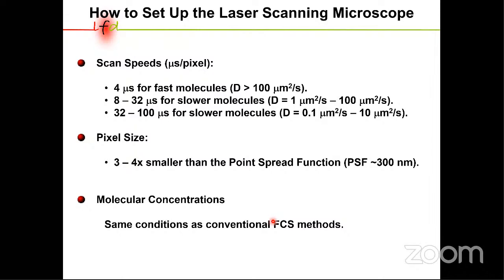It turns out that theoretically, if you increase the number of molecules, because the signal increases as well, you would expect the same signal to noise, so nothing should change. However, in the real world, you have other fluctuations. For example, from your laser, the power can fluctuate a little bit. You can have fluctuations from the electronics in your detector. And as you go to higher concentrations, then these will dominate your measurement. And this is the reason why generally those methods work better with lower concentrations.